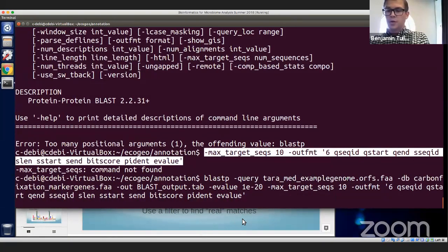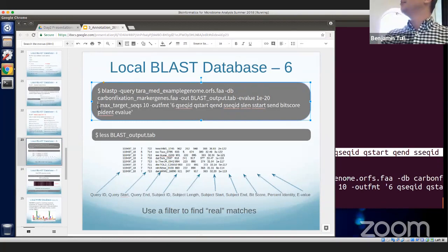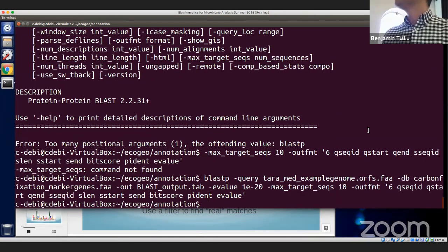Great. Okay, so the problem is that this has added an extra return here. If you're copying from the PowerPoint and you go back, just hit delete at the beginning of this dash for max, and it's going to remove that space. You can see that now instead of a return, there's a space there. If you make that small little change and now copy it, it'll run correctly on the computer.